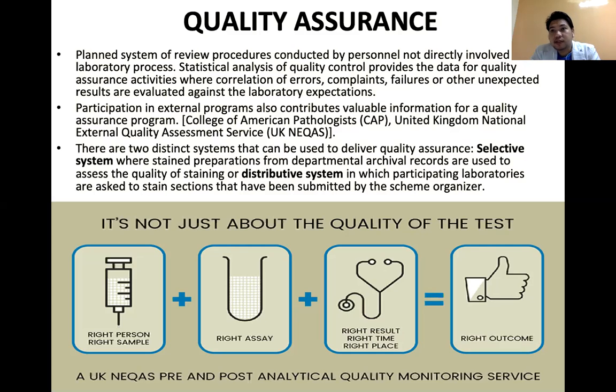For the reading purposes naman, yan yung analytical phase naman. Okay? So these third-party external programs, you're going to enroll yourself. Tapos, magpapadala sila of either stained for reading and unstained for staining NECAs. Okay. Now, kung pumasa ka for this NECAs, they will give you an accomplishment certificate.